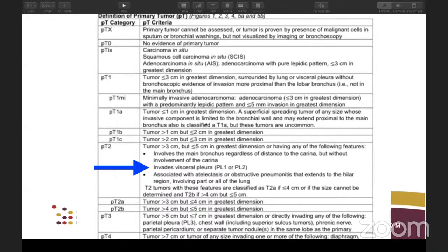So these surfaces are important and you should not ignore them, but don't call them margins. This is the same, we had a discussion at work recently, about on Whipple specimens, the anterior and posterior surfaces of the pancreas. They're not margins, but they're important surfaces.